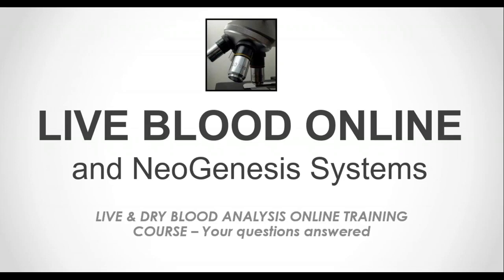Many of these microscopes are fairly cheap, and they claim to be dark field microscopes, but they're not really suitable for live blood analysis. Mainly because of the features that we just discussed, the strength of the light source and so on. Now remember, the dark field is not exclusive to live blood analysis. It's a technique that's been used in microscopy for many years for various types of applications. However, the researchers that started working with live blood analysis in dark field found that there are a very specific set of requirements for a microscope to actually be suitable to analyze live blood in dark field properly.